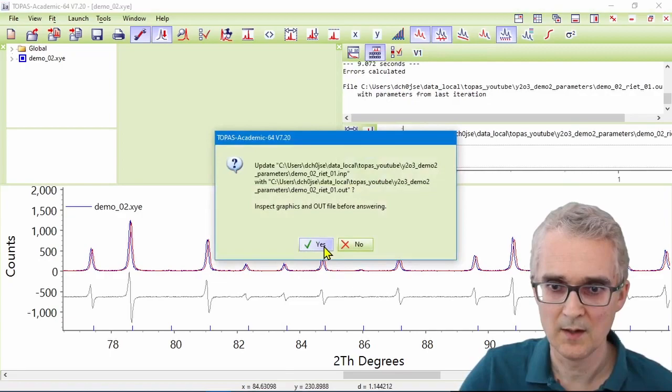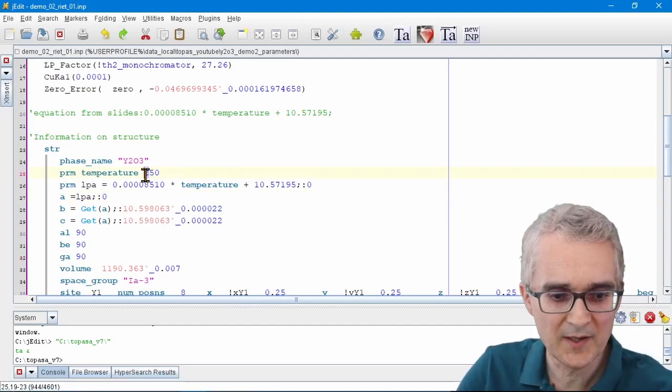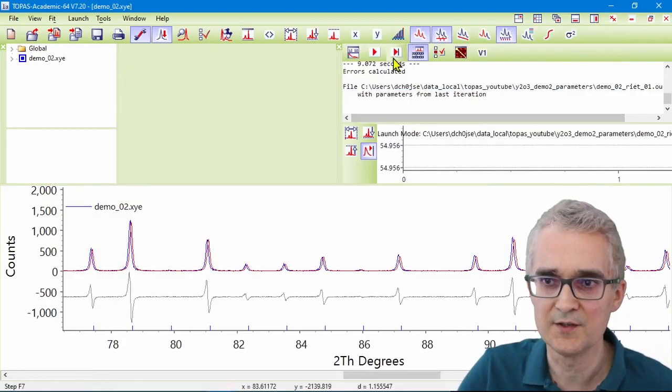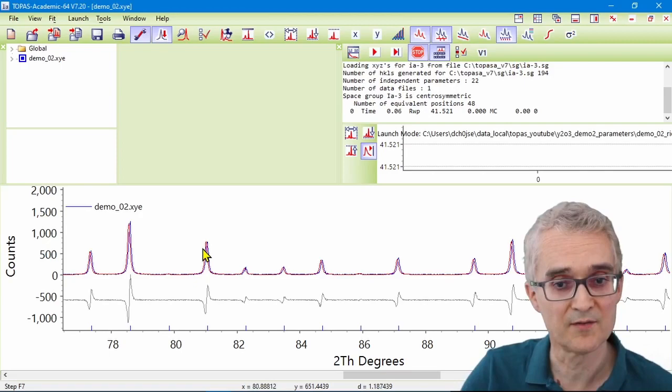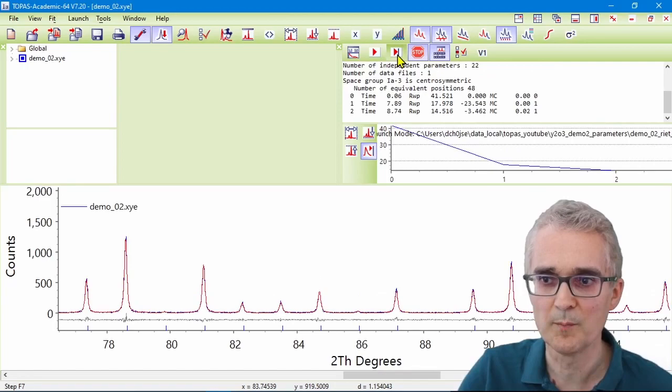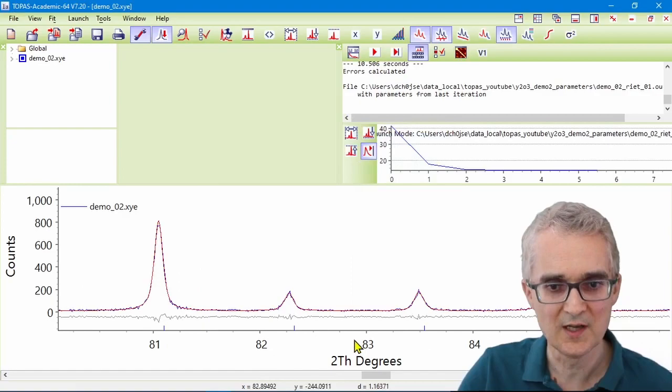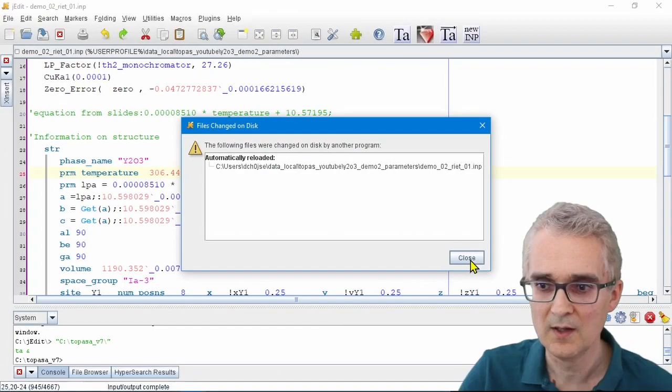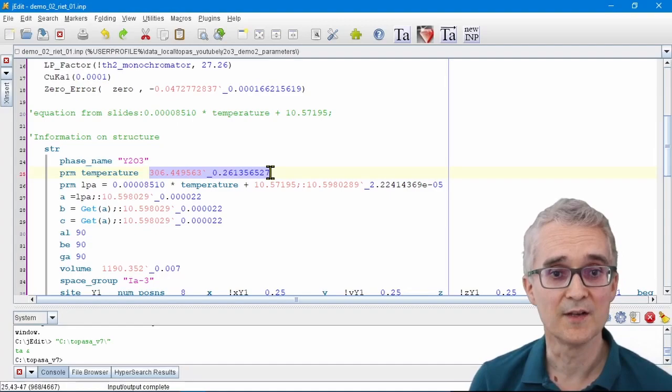I won't update my file. Let me go back to the file. Now let's try making the temperature, say, 350 degrees. So now the cell parameter should be calculated too large. And so if I do a single step, can you see the peaks have shifted to the left of where they ought to be? So because this is now a refinable parameter, if I step through the refinement one by one and then refine to convergence, what we should find is now the peak positions are in exactly the right places. If we go back to the TOPAS input file, we'll see that the temperature of the sample is refined to 306 Kelvin.